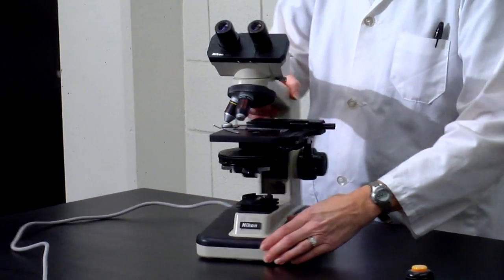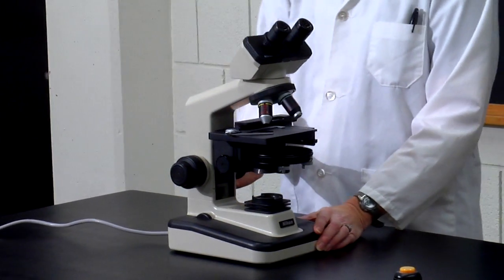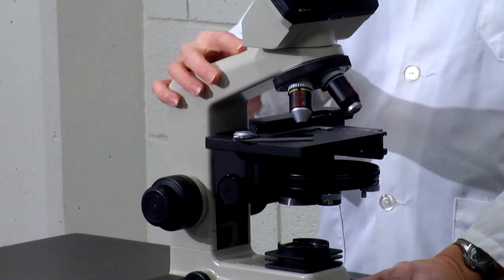Let's first describe some of the parts of the microscope. I've already mentioned the arm of the microscope, which is at the back of the microscope and supports the lenses.